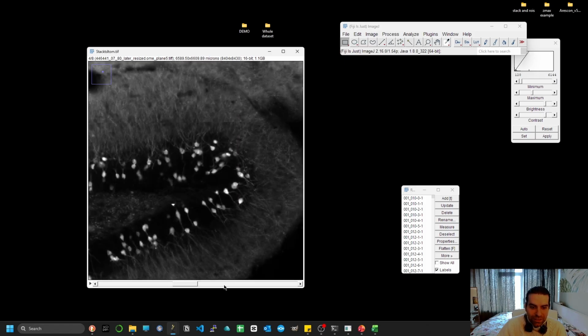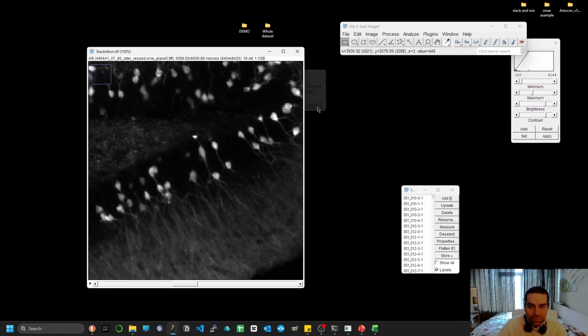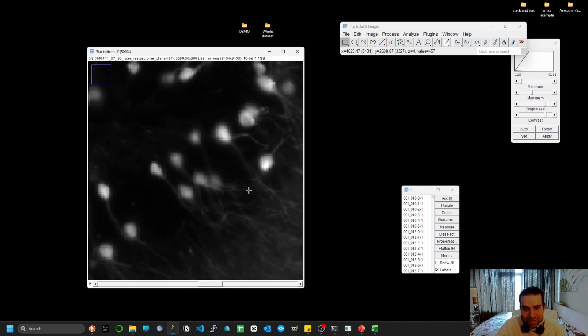So we're coming here, and now I'm imposing the regions of interest, and you can see that it works quite clearly. And here's the thing, if you don't filter across the Z-plane, you'll have one observation, one ROI for that, but you might also have one ROI for that, pretty much. You might even get one ROI for that, so it will be very messy, right? Because instead of one ROI, you have 4 or even 5 or even more. But you can see that the Z filtering worked fine.